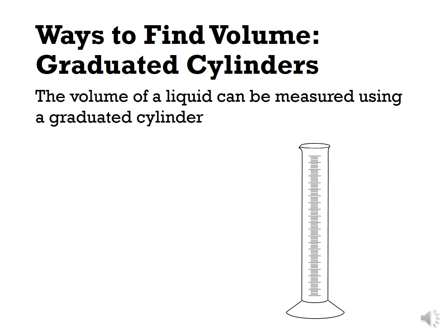Scientists use graduated cylinders in the lab to measure the volume of liquids. Now, we've previously discussed reading the graduation marks of graduated cylinders, and we'll be utilizing that skill when we are finding volumes of liquids in future labs. If you need a refresher, I recommend going back to the video about graduated instruments.